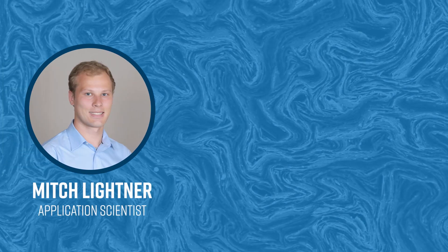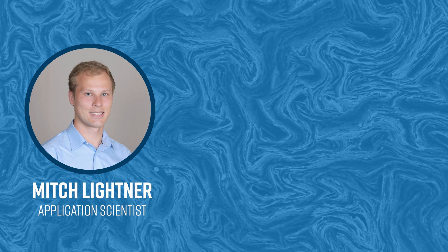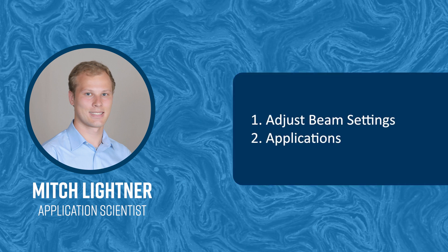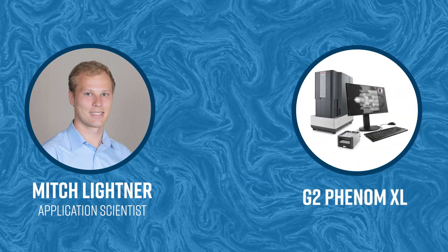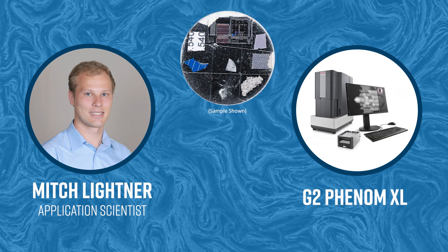Hi everyone, my name is Mitch Lightner and I am an application scientist with Nanoscience Instruments. Today I will be walking through how to adjust the beam settings and briefly describe their applications. I will be demonstrating on the G2 Phenom XL, but these methods work on any Phenom SEM.